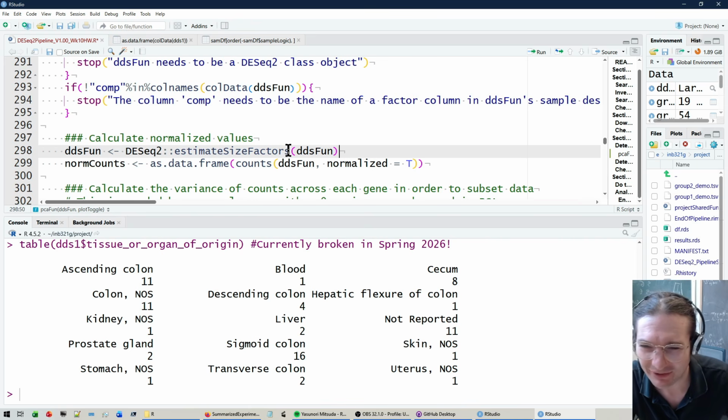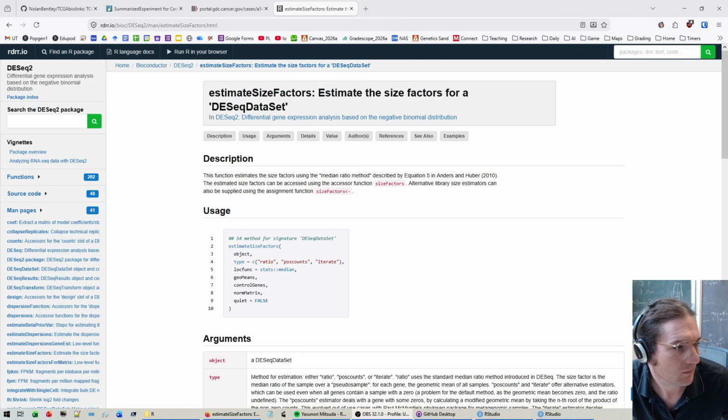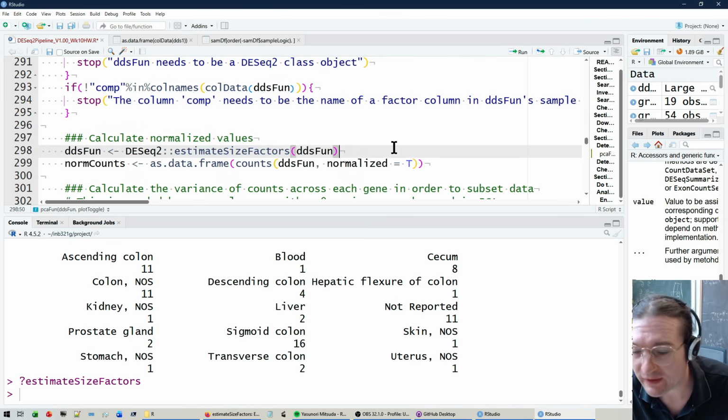Dang it, I haven't looked at this in a bit. One sec, let me pause and go do that research real fast. Research concluded. It's both. It does both at the same time. So that's what I need to know. So it's very similar to the TPM calculation, as I said.